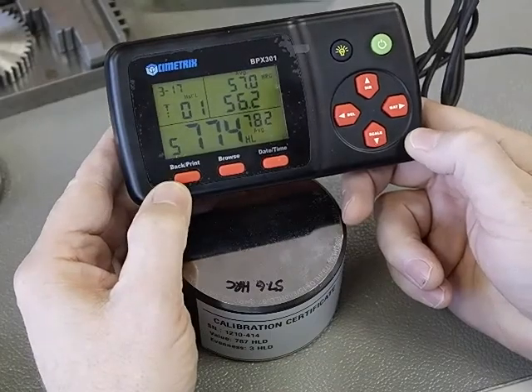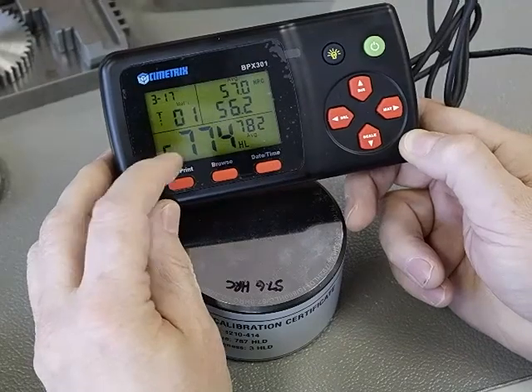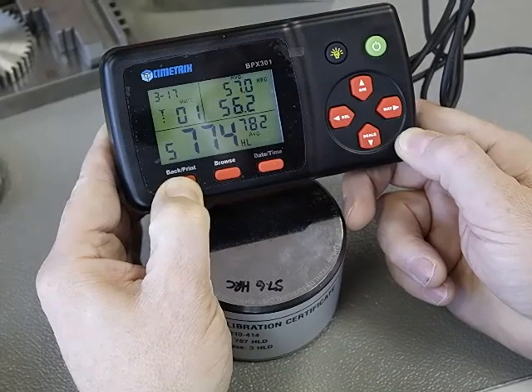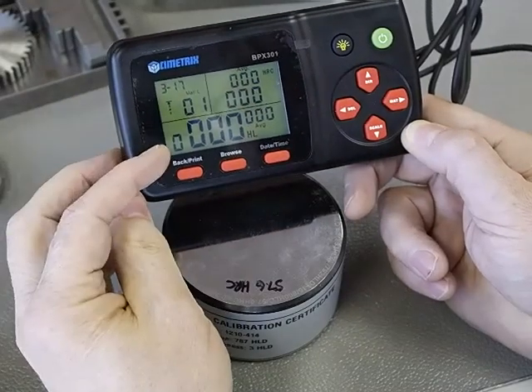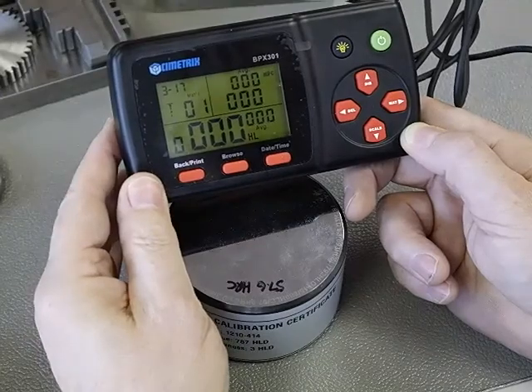To get to the calibration mode, all we do is hold down the back print button until the display flashes and the zero here flashes. Hold it down about 4 seconds. The display flashed, it's gone to zero, and you can see now that everything on the display is showing a zero reading.